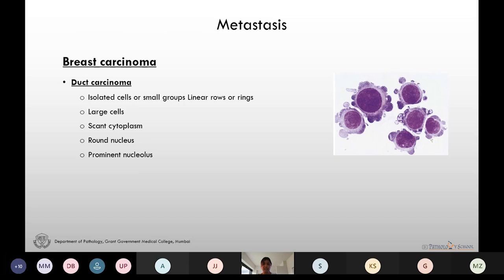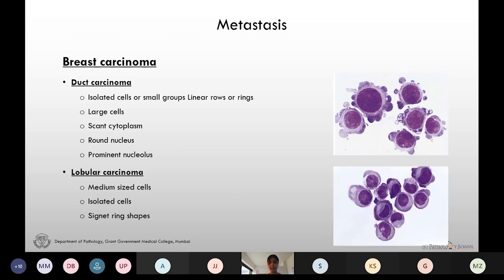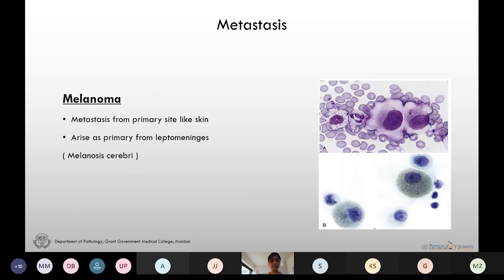Followed by lung carcinoma, breast carcinoma can also metastasize to the CSF. This is the picture of ductal carcinoma cells in the CSF — large round to oval cells with very scant cytoplasm, large round nucleus with prominent nucleoli. This is the picture of lobular carcinoma in the CSF — here the cells are relatively medium-sized with a semilunar to round to oval nucleus.